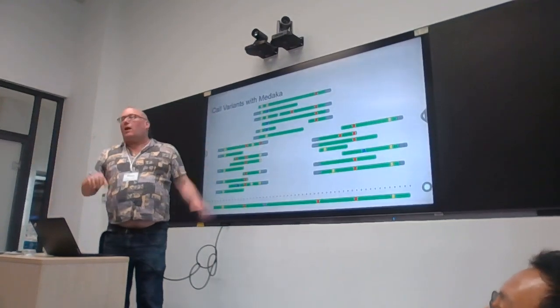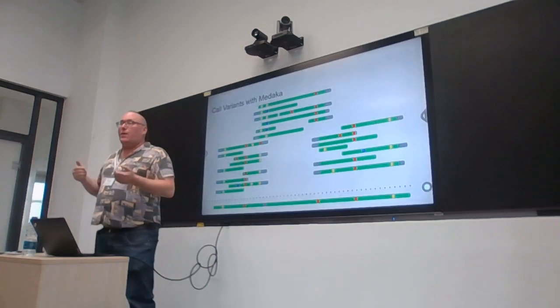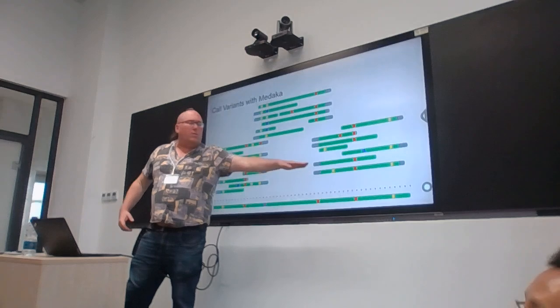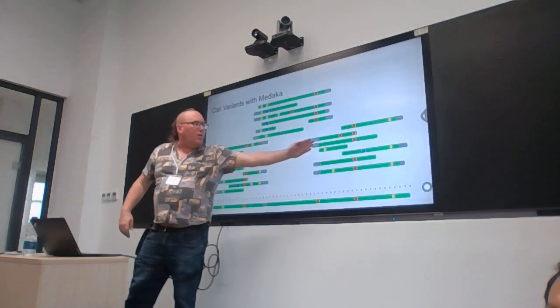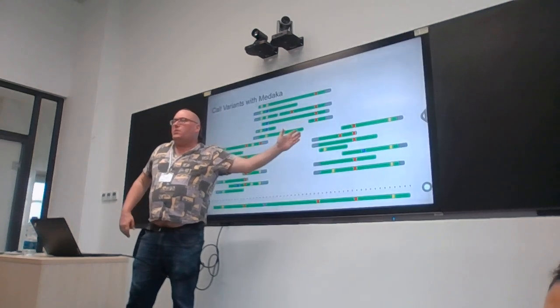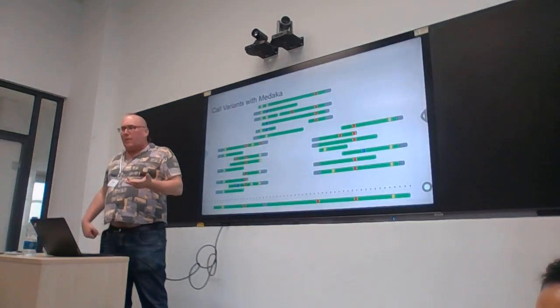But let's say that I said I want depth at least 5. I don't believe the data unless there's at least 5 there. I would not make that a yellow one. I would make that gray or something like that. I would make that an N. I would say I don't know what the sequence is at that position. Wherever the depth is below 5, I would make it N, because that means I don't know what is there.